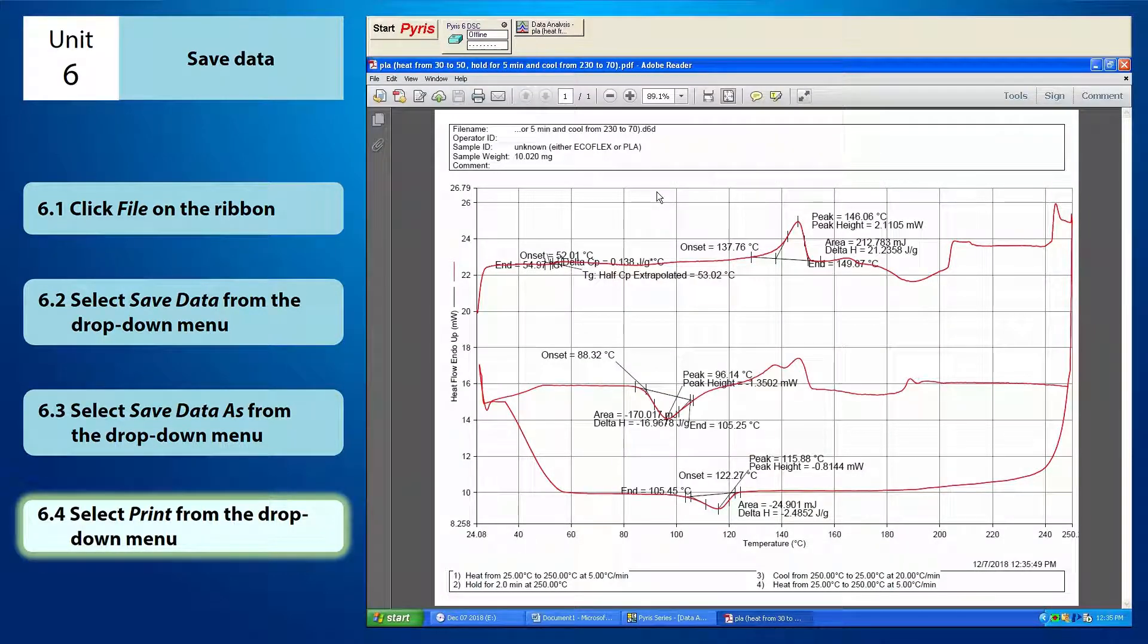Now, your PDF file is ready. Ok, that's all for this tutorial video and good luck in using the Pyri6 DSC software.